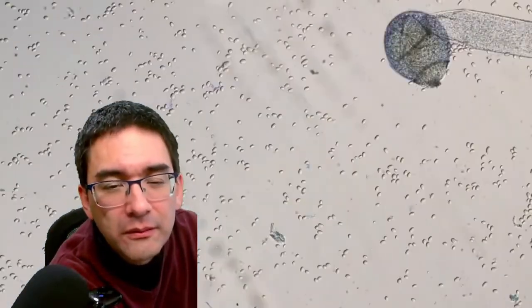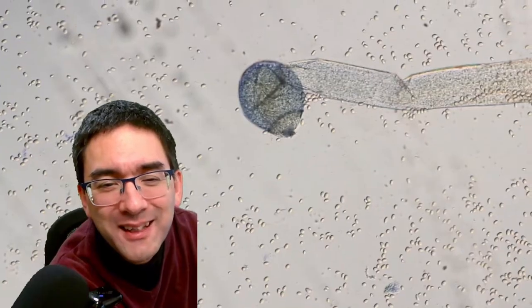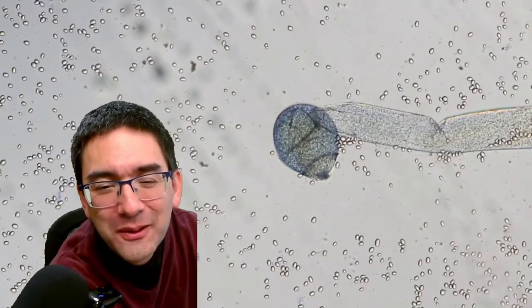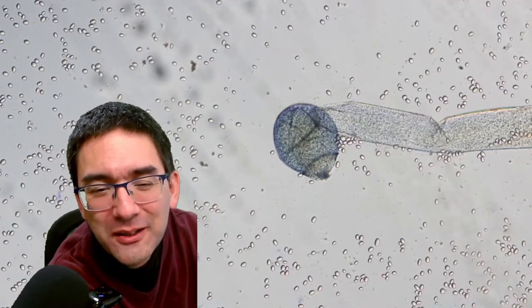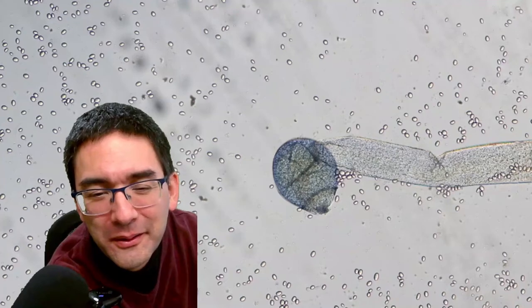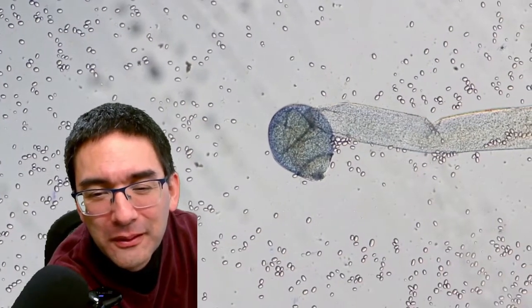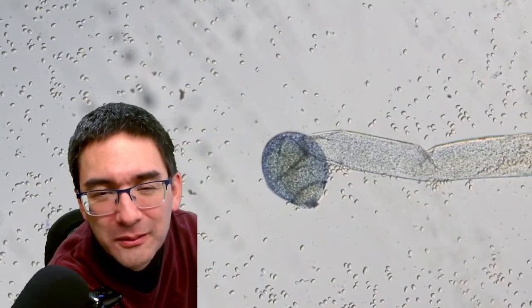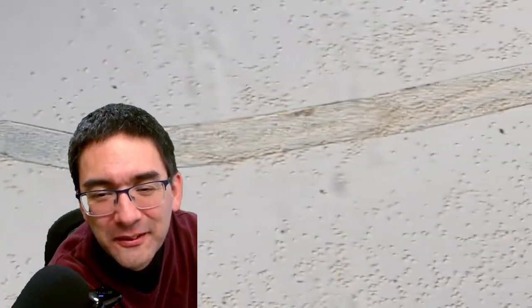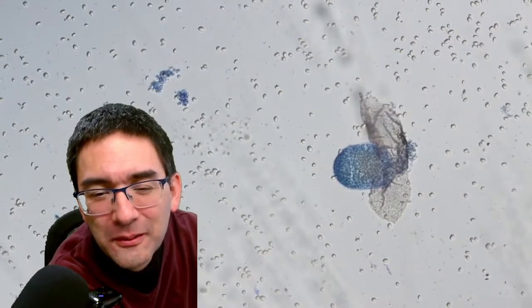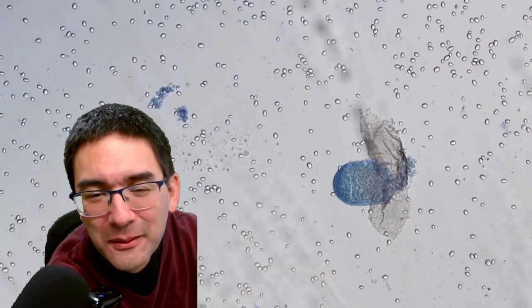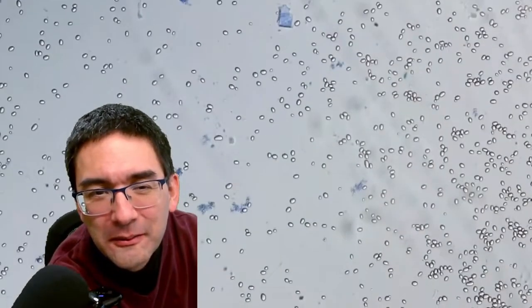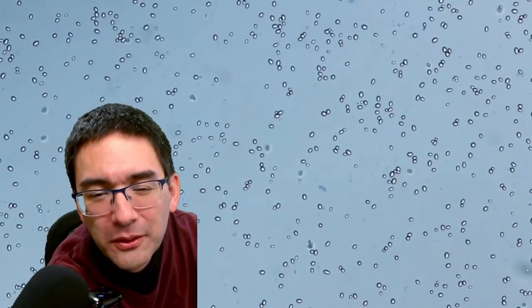But let's have a look here. You see, that's interesting to see this here. It does turn slightly blue. So there is a little bit of stain here, which is immediately accumulated by the fruiting body. But the spores themselves, they don't stain so much. So that's the reason why the fruiting body does turn a little bit bluish if you are able to see that. So a little bit of the stain has already reached this. Look, the spores don't stain, but the rest does. Here definitely it goes blue here, but not the spores.